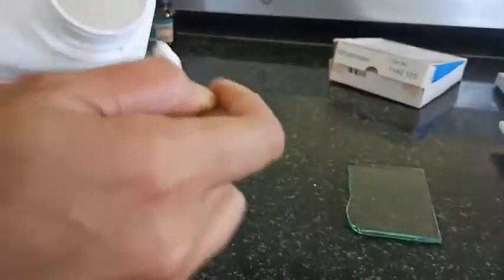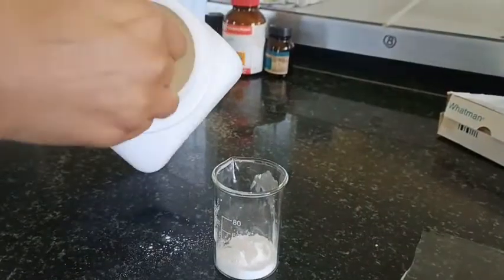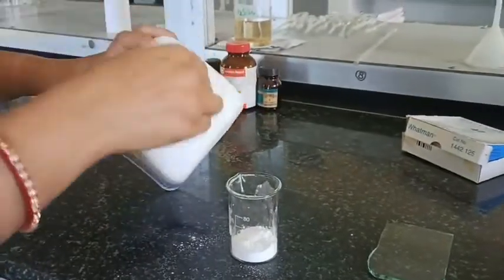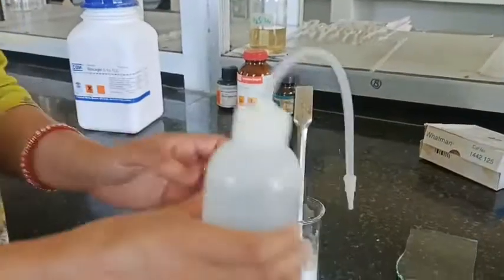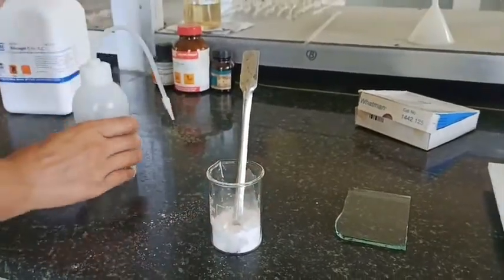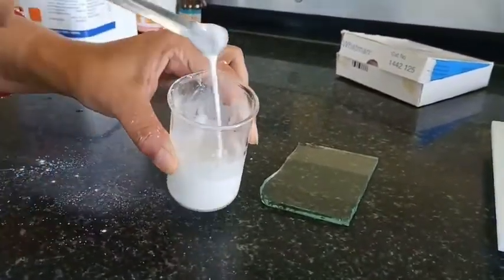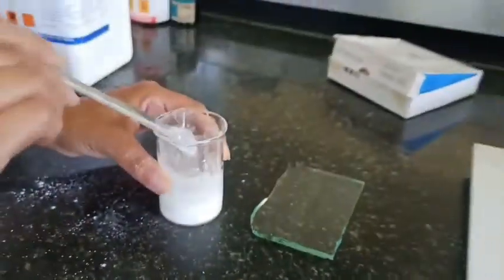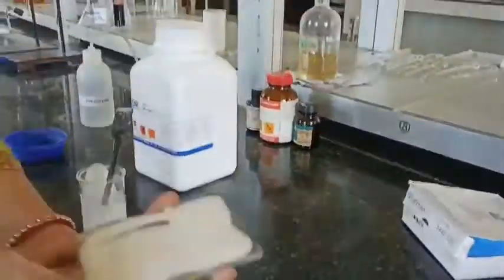I'll first take some amount of silica gel. The amount depends on the number of TLC plates you need to prepare — accordingly you have to take the powder. Now add some distilled water to this to make a slurry. The slurry should not be too thick or too dilute, because if it is too thick then there will be cracks on the TLC plate.